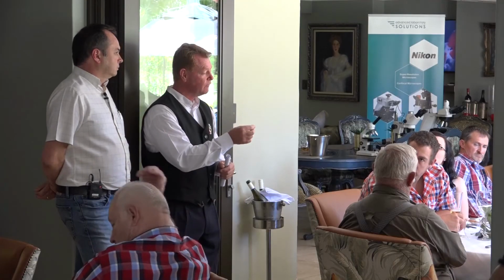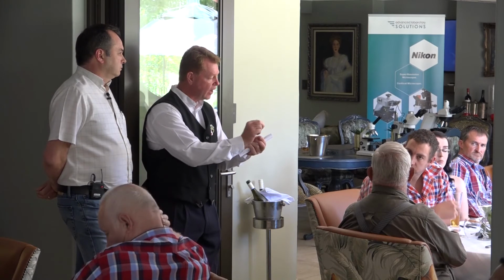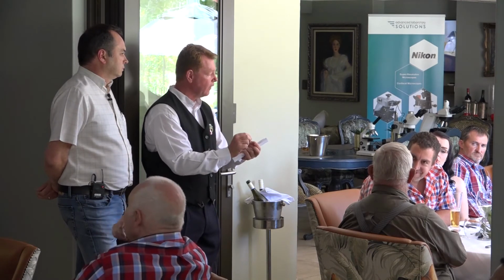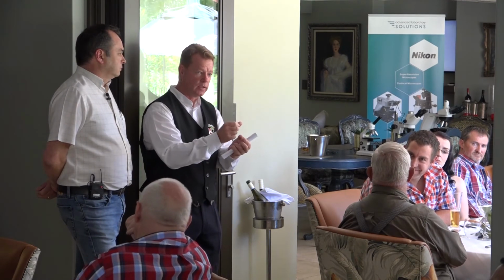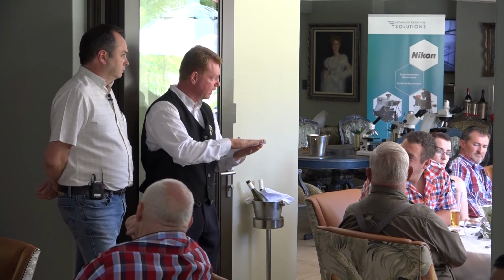It's not a live scale anymore. It's nicely under that roof tile, as I always say, where it's hiding. So what I'm talking about is, if there's heavy mucus, you divide that into a quarter, and then you spread that as best you can on the slide itself before you put the cover slip over.